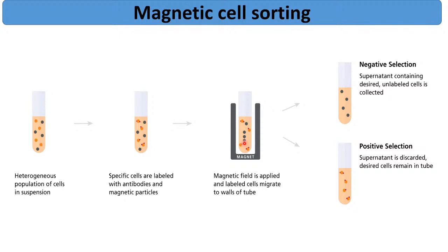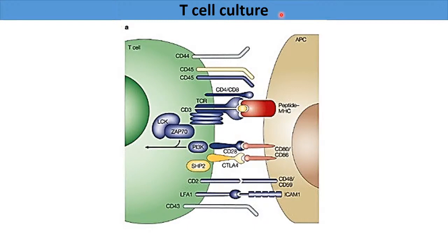Now I am going to explain a complete flow chart of one type of cell culture. So you will be able to understand how we actually apply whatever I have told you till now. And that will be the end of my cell culture discussion. So let's imagine I want to grow T cells. I have to work according to this difficult picture, and I will explain what that picture is. Even if you understand 70 to 80% of this discussion now, that will be more than enough, because this is a little bit complex.